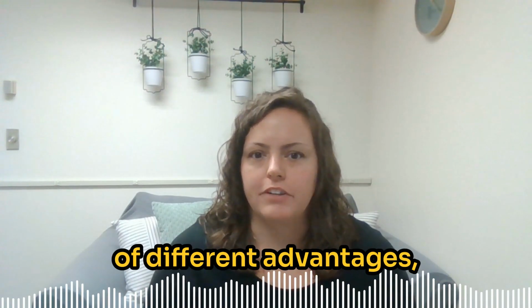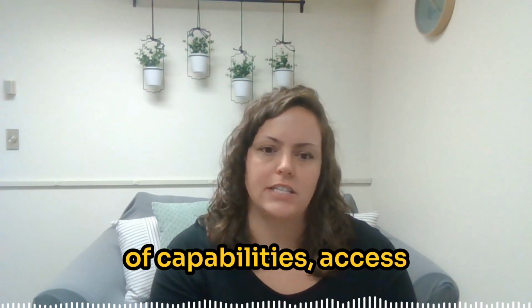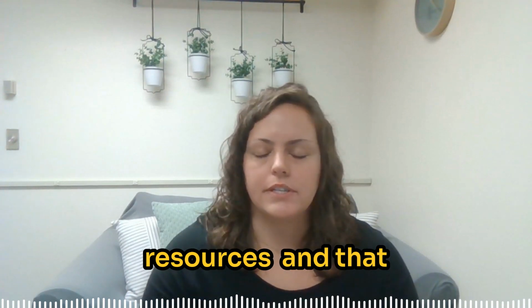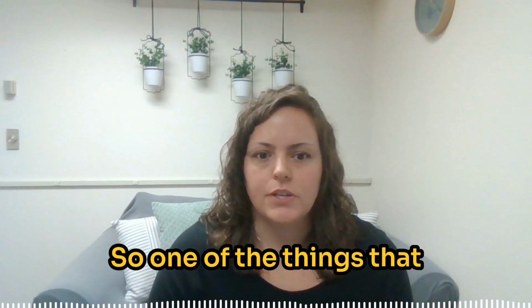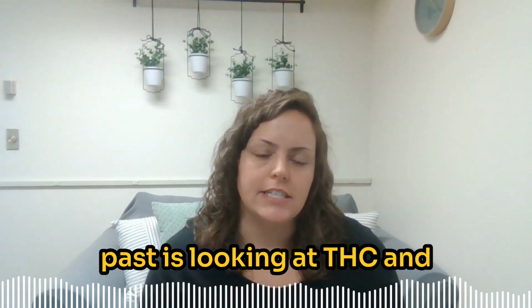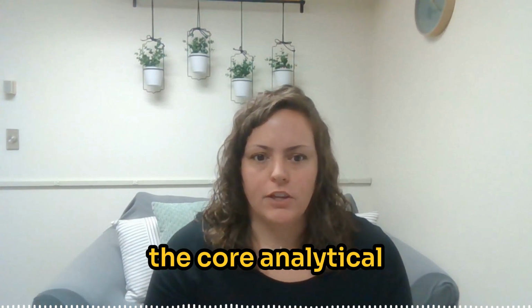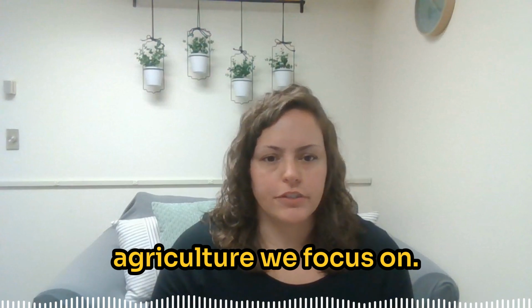So core labs have a lot of different advantages, right? Different networks, a lot of capabilities, access to a lot of different resources, and that allows us to work on a lot of different projects, as you mentioned. So one of the things that we have worked on in the past is looking at THC and CBD and hemp samples. My lab specifically, the Core Analytical Lab at the University of Nevada, Reno, is an agriculturally focused lab.